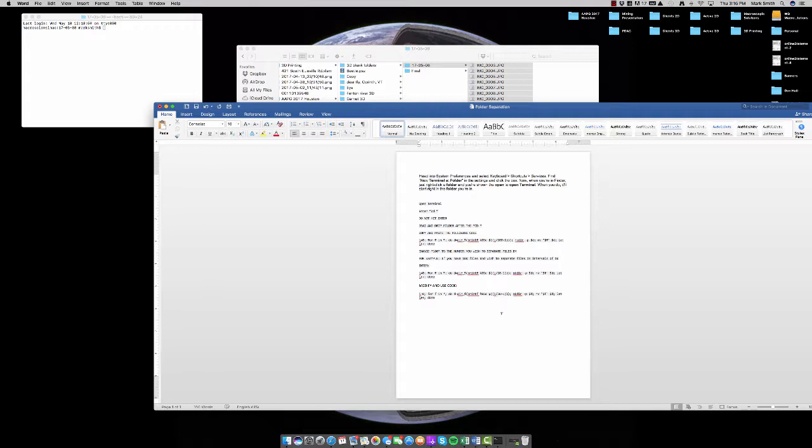Now, let's say you didn't set up your parameters to take 35 steps, which equates to 36 images. Let's say you had it taking 65 steps, which is going to equate to 66 images. So you would input 66 here, and now it's going to separate out new folders every 66 images. But we didn't do that. We used 35, so we're going to place 36. And all you want to do is copy that code.